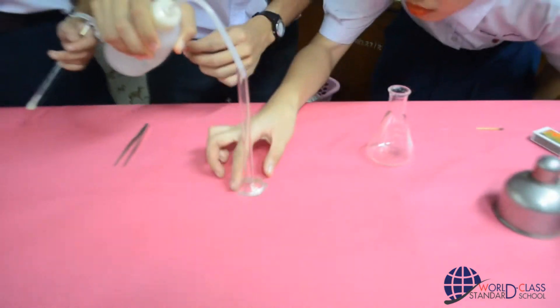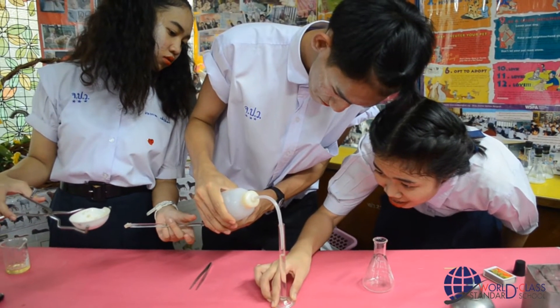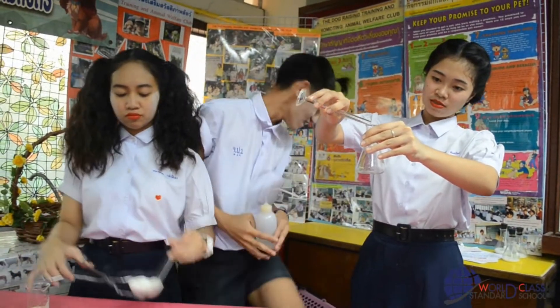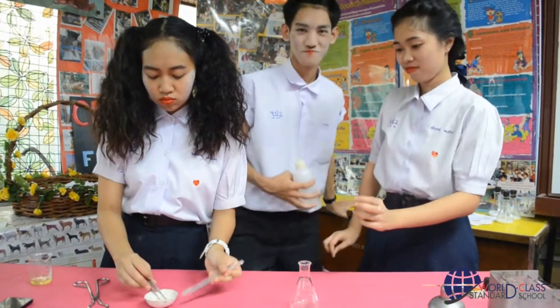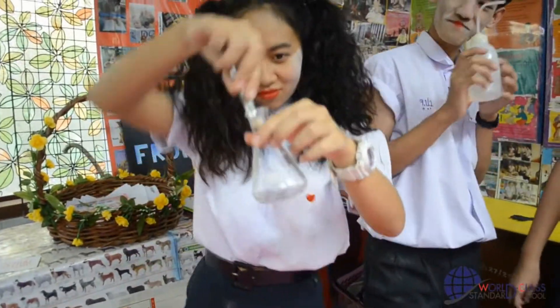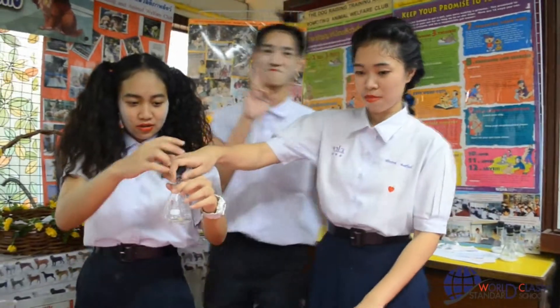Second, pour the substance into a conical flask and add water, a few cubic centimeters. Check also the changes and records.